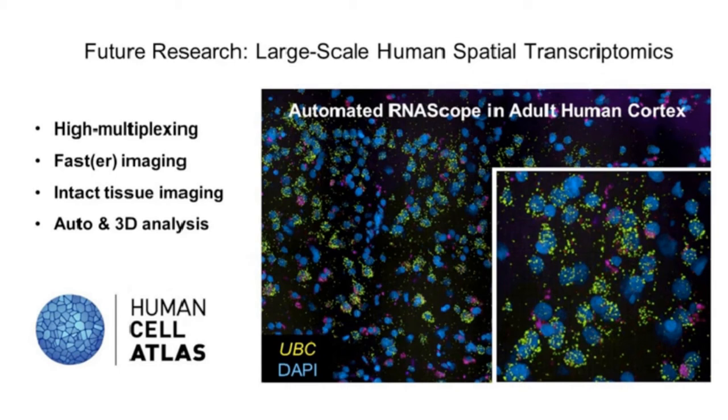As we add more content, as we make our mapping higher content by adding multiple cycles of imaging, we would like to compensate by increasing our imaging speed, and for this, I'll be using newer generation spinning disk confocals. While we're still interested in imaging standard tissue sections, the technologies are now allowing us to apply these mapping approaches to intact tissue, so you can identify 3-dimensional interactions between different cells in thicker tissue volumes.